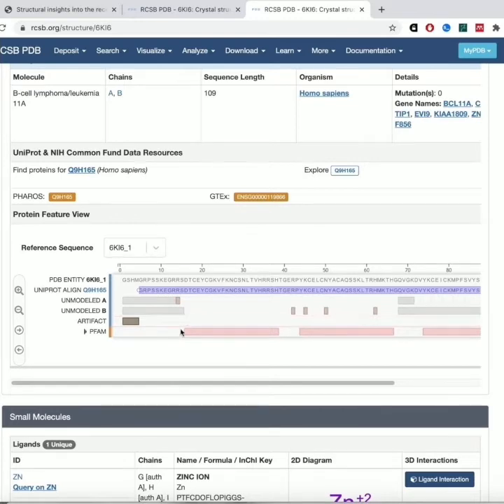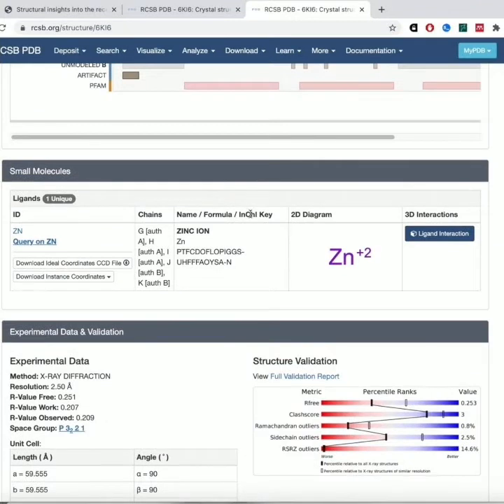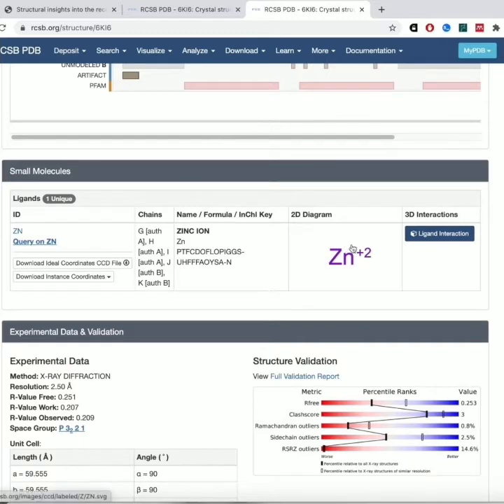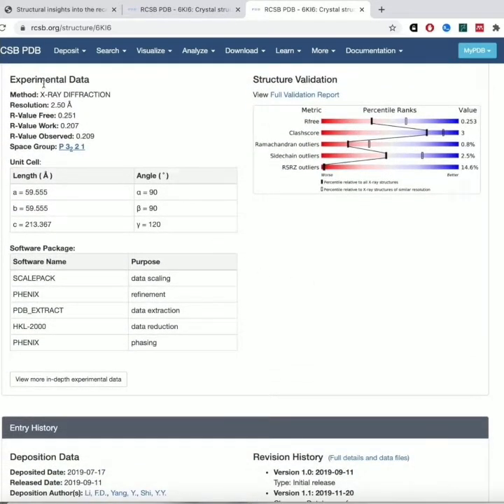We also see small molecules — it says they found a zinc atom in here. Then you get more information about the experimental stuff: this is an X-ray diffraction structure, so it's a crystallography structure, giving you information about various crystallography terms.